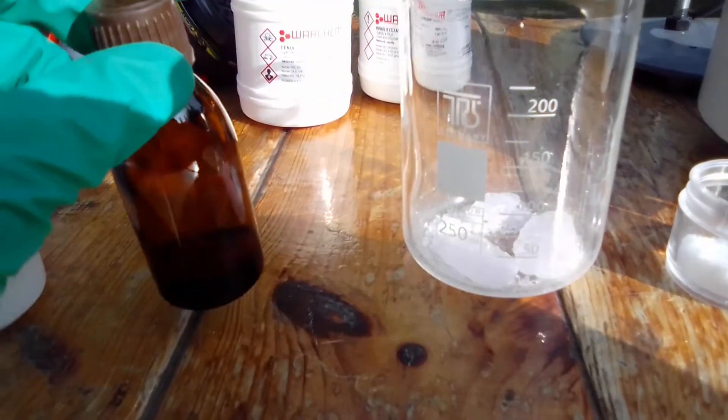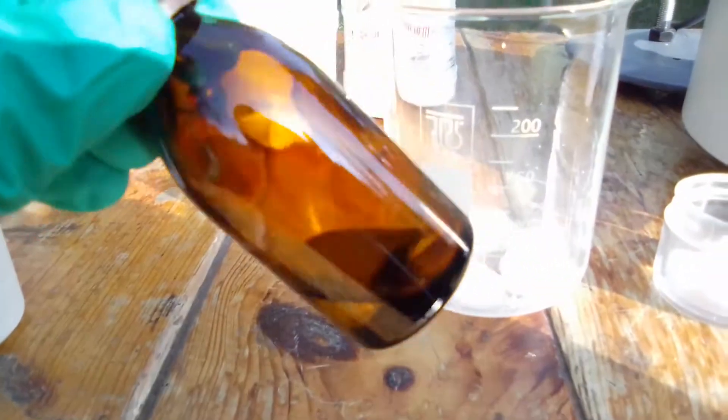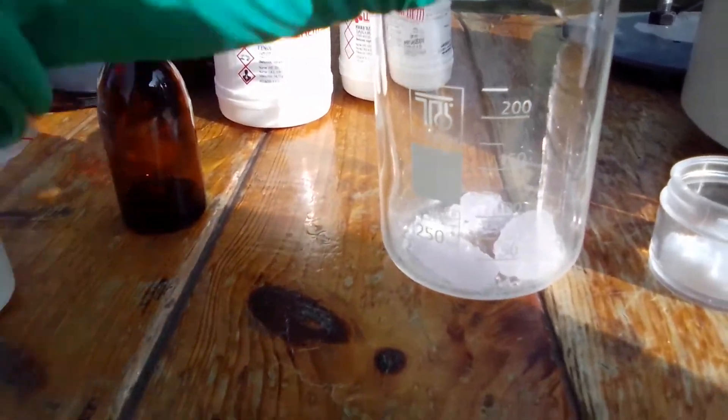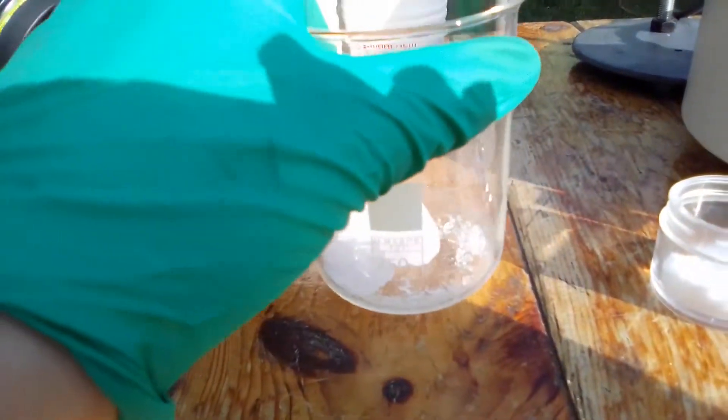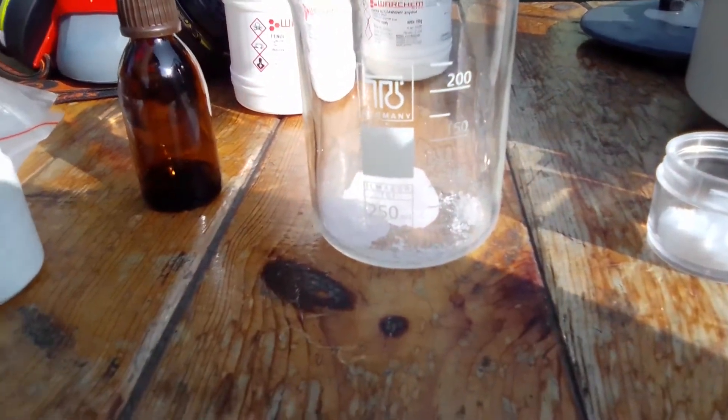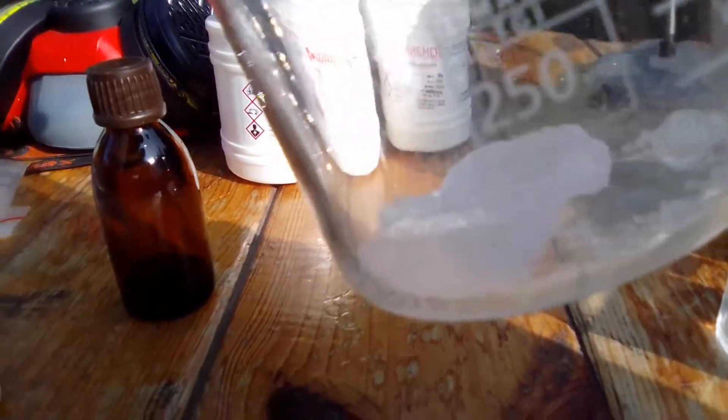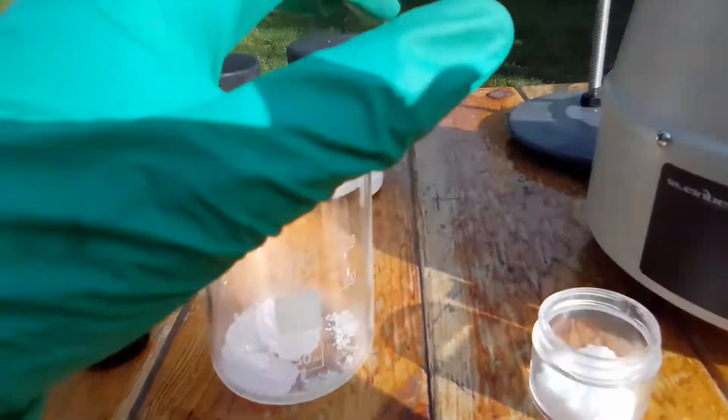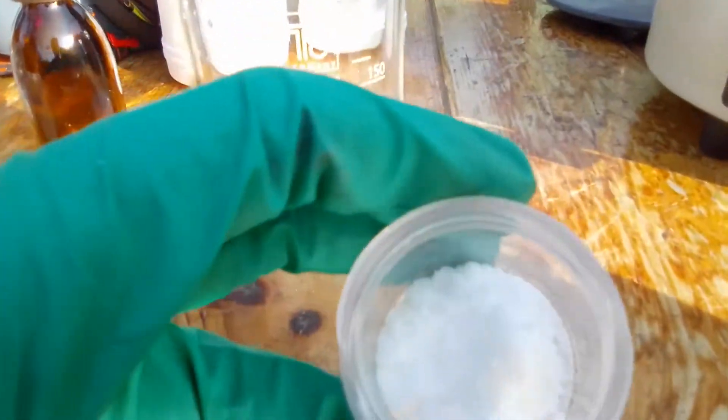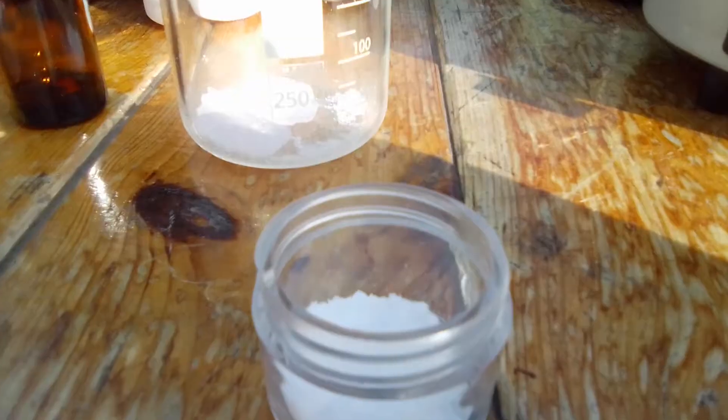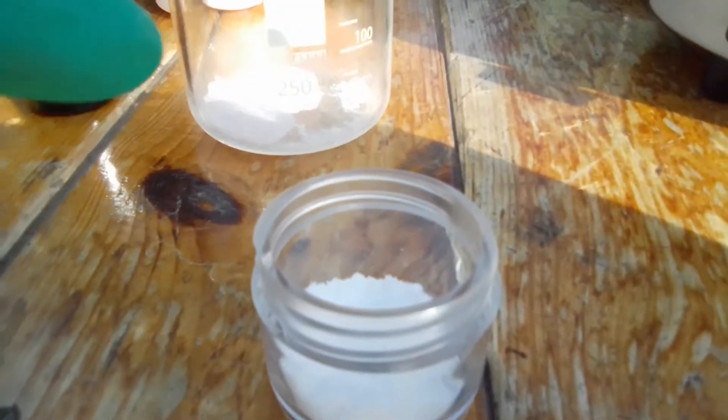For this we will need 7 grams of concentrated Sulfuric Acid, 9.59 grams of Phenol (mine is a little bit contaminated, it should be clear, not pink), and also 4.28 grams of Oxalic Acid dihydrate.